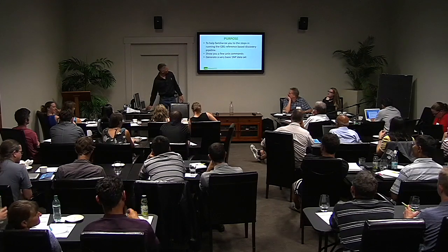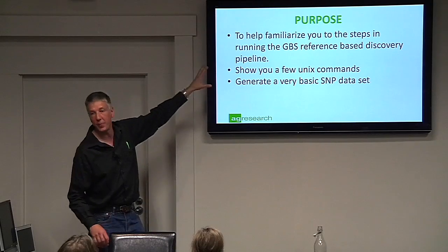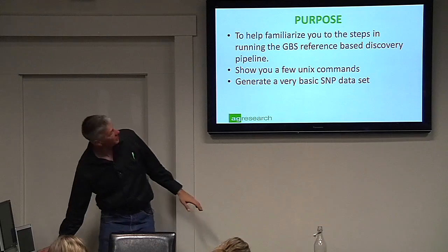Okay, the purpose of this exercise that we're going to do tomorrow is to help familiarize you with the steps in running the reference-based discovery pipeline. Okay? And it's to show you a few Unix commands and generate a very basic SNP data set. That's the purpose.